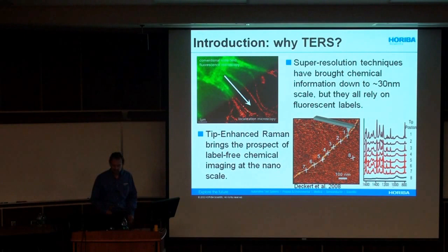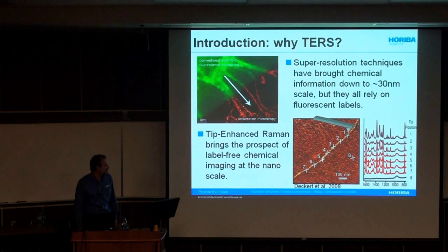And this is a quick example of some spectra of a longer DNA strand, actually RNA strand in this case, using Tip Enhanced Raman. So let's go over the basics.